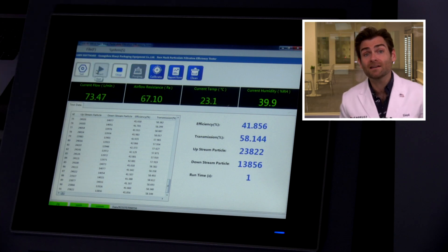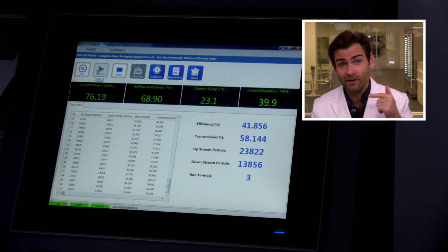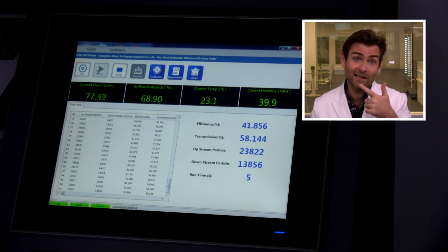This is a PFE machine — particulate filtration efficiency machine. If you want to find out more about what this thing does, check out that link. Remember, we are testing just the filtration here. We're not testing the fit — that's not possible to do with this machine, well it is, but it's a lot more complicated. So we're not doing that, but you need both things when choosing a mask.